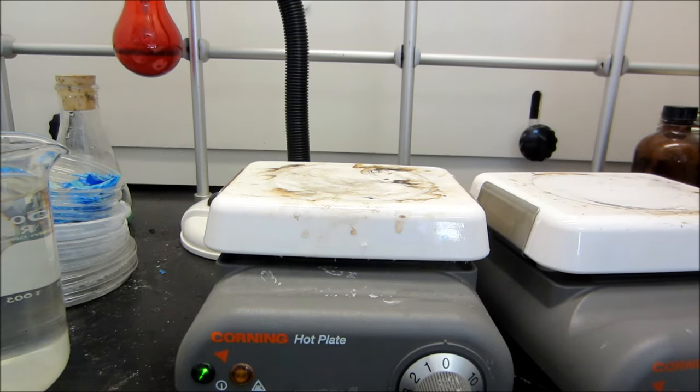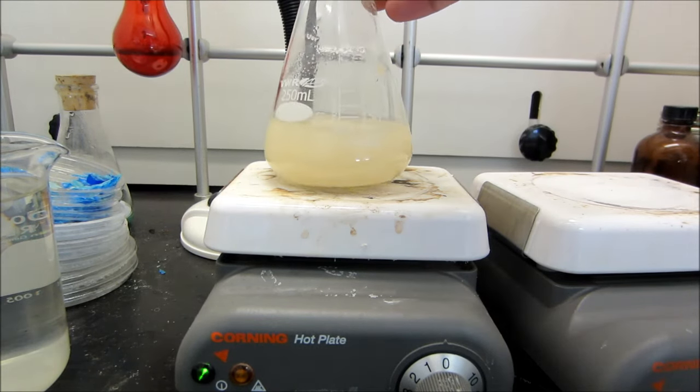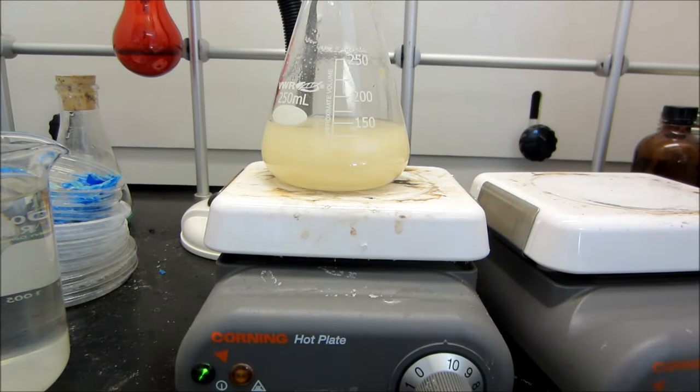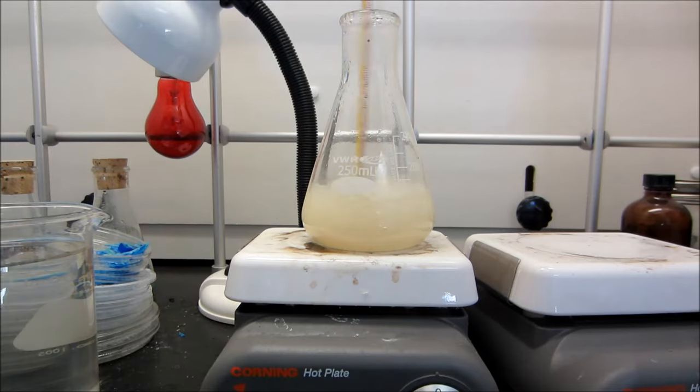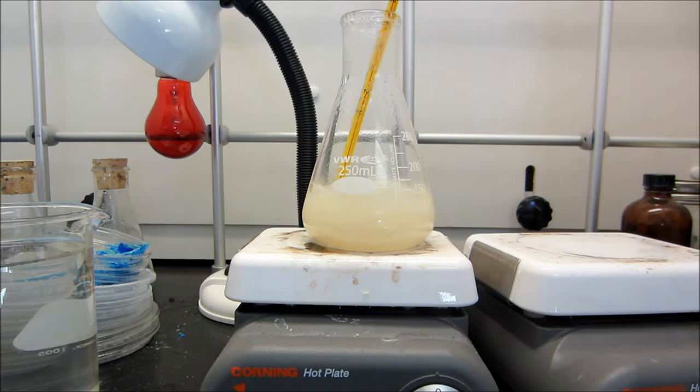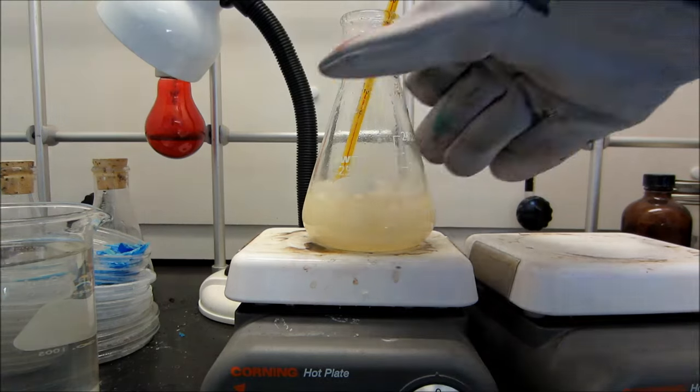I'm going to take this one that needs to be boiled. I'm going to stick it on my hot plate here. We're going to fast forward a little bit while it heats up. It's a few minutes later and it's come to a boil. You can see it bubble. I've got to stir it the whole time or else it'll start to cook.